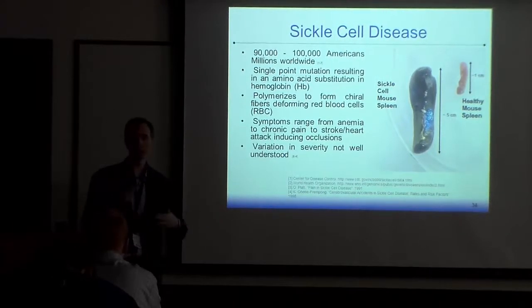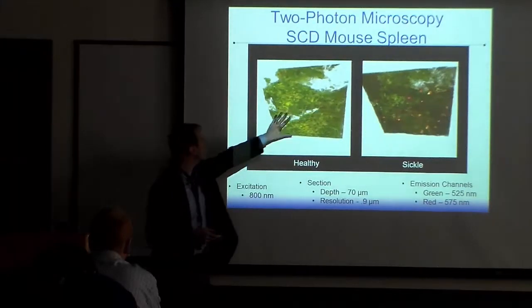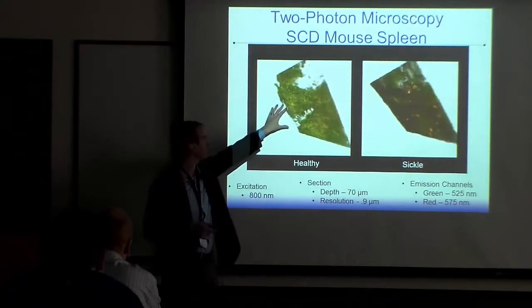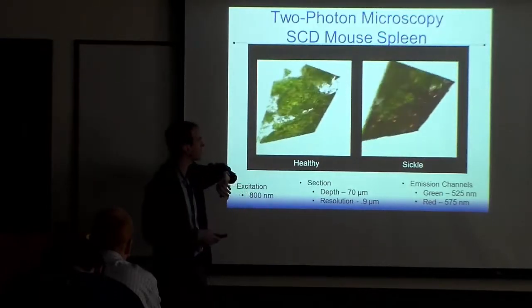And so we're trying to find studies on this. We look at a lot of different tissue, brain, in the sickle cell mice. We have a bunch going on, but I just want to use this as an illustration of stuff you see. So what you would see then in a healthy tissue, this green kind of corresponds to the cytoplasm of this tissue, and this is kind of poor resolution, but you see good structure of the cells, and you can learn about the organization and progression of this disease state.